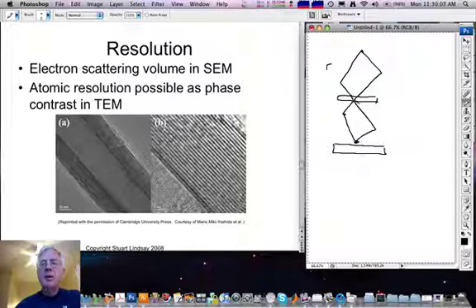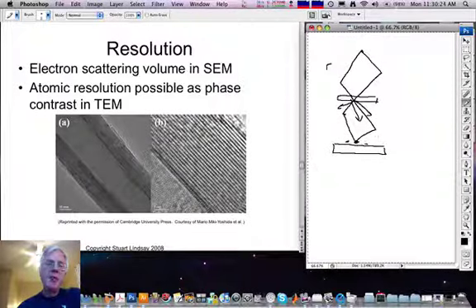But what happens in the sample is electrons are diffracted by Bragg reflection of crystal planes, for example. So in fact, it turns out that almost any sample will give fringes of atomic dimensions owing to the collection of these diffracted beams and their imaging on the plate down here. However, this is not genuine atomic resolution. The problem is this: when the sample is very thin, as it needs to be for this technique to work, the contrast exactly at focus is close to zero. Atomic fringes occur when you defocus the microscope so as to in effect just carry out a diffraction experiment.